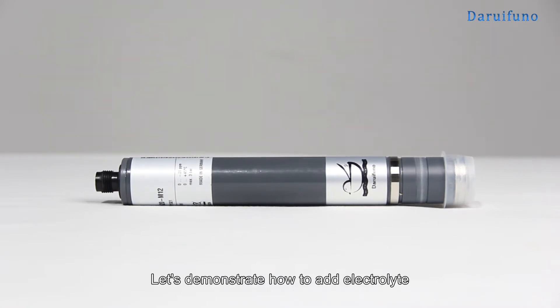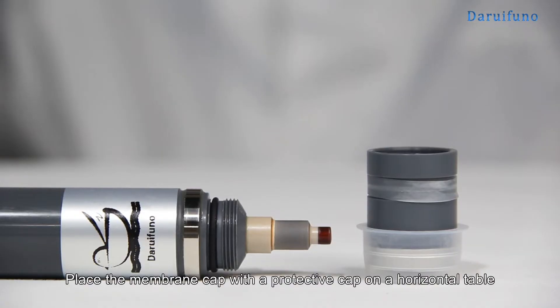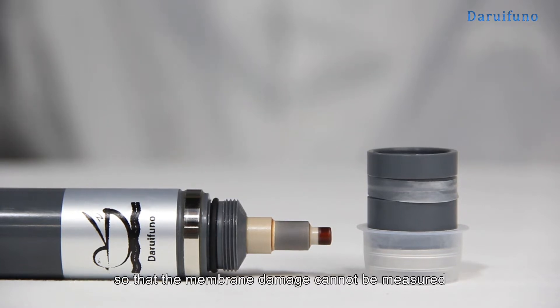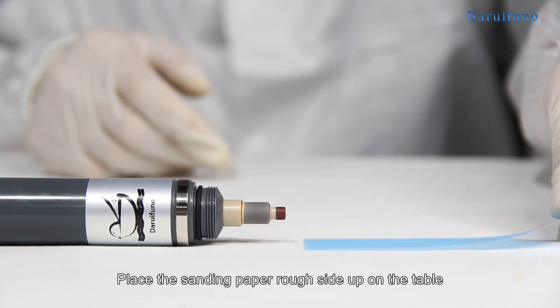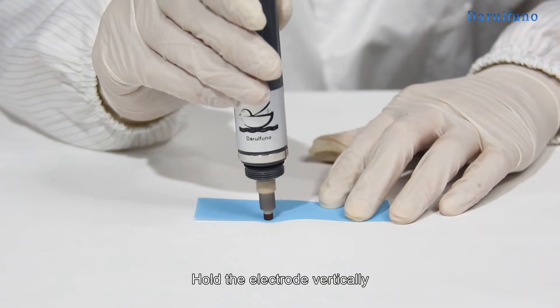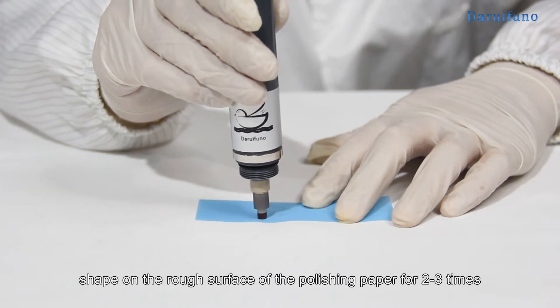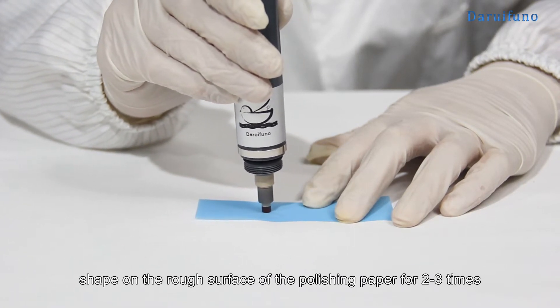Let's demonstrate how to add electrolyte. First, remove the membrane cap. Place the membrane cap with the protective cap on a horizontal table. Do not directly touch the membrane of the membrane cap to the table, so that the membrane cannot be damaged. Place the sanding paper rough side up on the table. Hold the electrode vertically and grind the working electrode back and forth in a figure-eight shape on the rough surface of the polishing paper for two to three times.